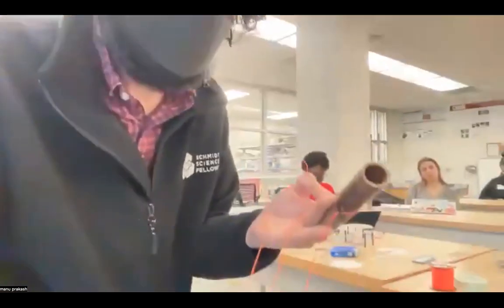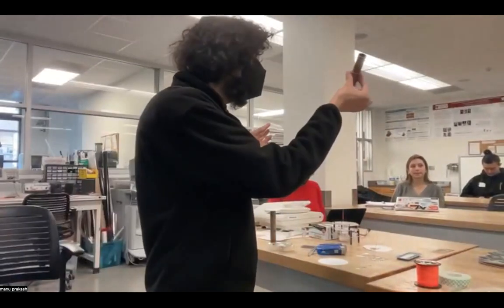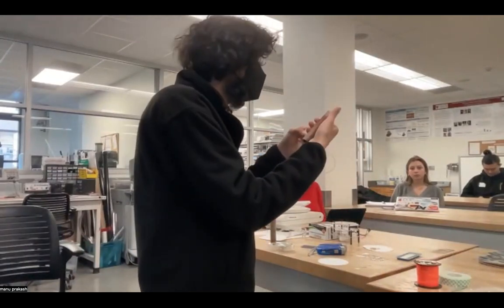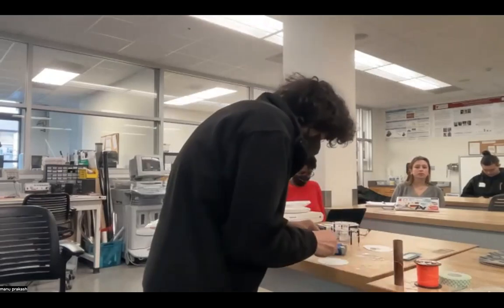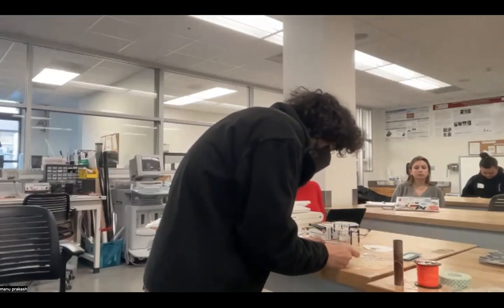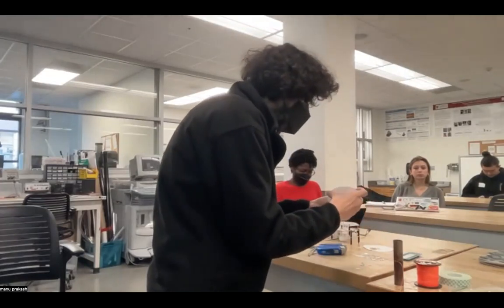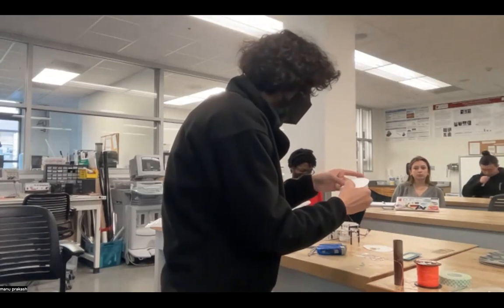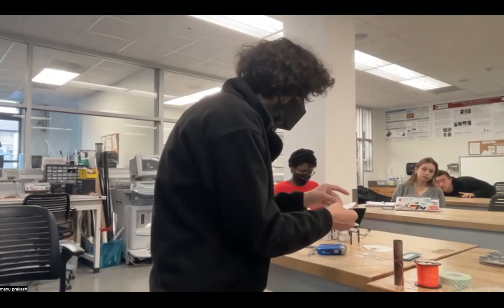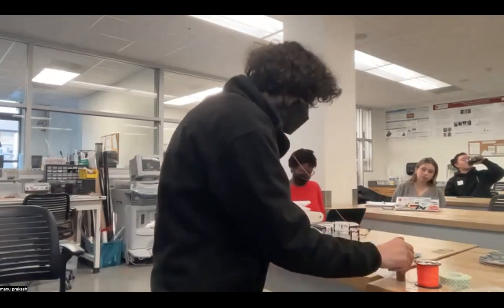So sorry, I'm talking, but I'm also just finishing building a paperfuge. So what I've done now is I just have a piece of a rod. We like this because otherwise your fingers can get pinched, so it gives you a nice little handle. And then this piece is important because this makes sure that the paper does not rip. And I probably need another double-sided tape here because this tape might not be sufficient.